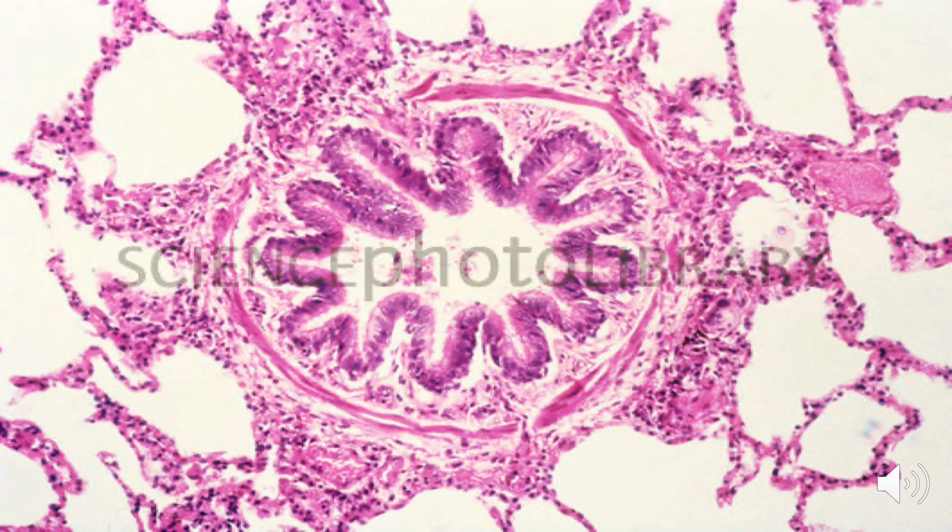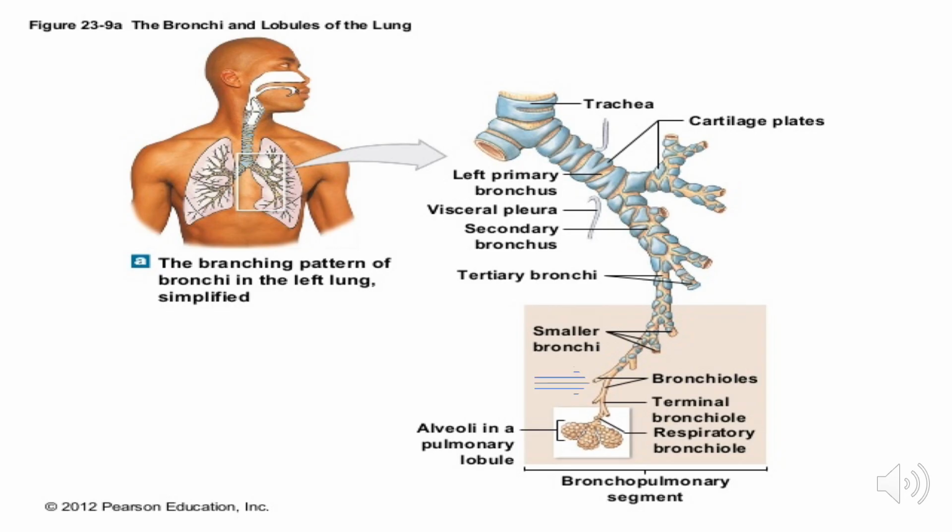This is another cross-section of a bronchiole. Please appreciate the absence of hyaline cartilage support in its wall. Instead, you have there prominent smooth muscle. The blue arrow is pointing to one of the bronchioles. Take a look at its wall. You don't have there the hyaline cartilages that you can find at the trachea and the bronchi.